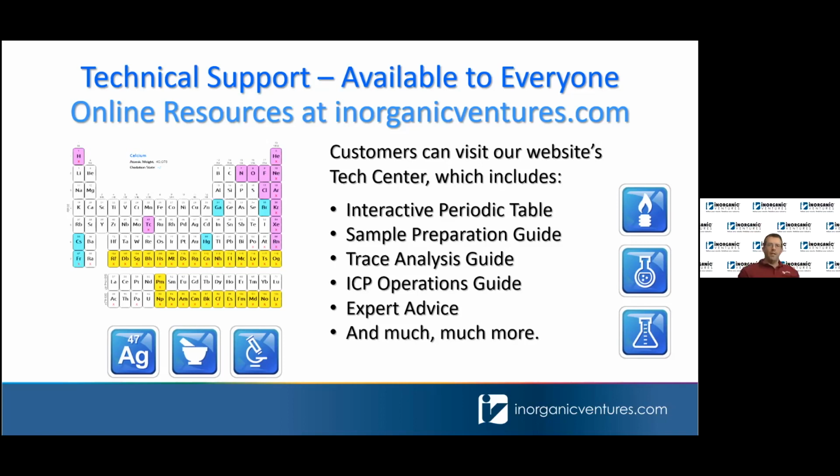Well, I believe that was the last question. We do have a reference from Thomas, I think in relation to your comment. Optimizing Sample Throughput in ICP-MS by Wilbur, Agilent Technologies. This is an Agilent ICP-MS journal, May 2006, issue 27. So I'll just repeat that for the attendees. This white paper is from the Agilent ICP-MS journal, May 2006, issue 27. The title, Optimizing Sample Throughput in ICP-MS by Steve Wilbur. If you have any questions about that or weren't able to capture that, please let us know, and we'll be able to provide that information.